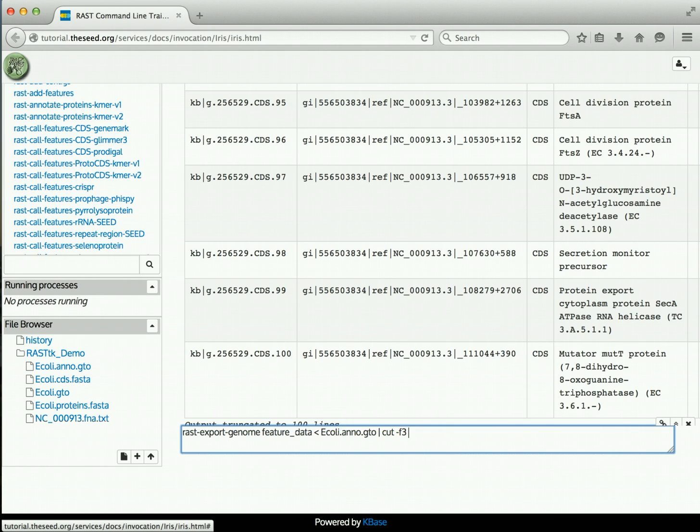And I'm going to pipe that output into another Unix command called sort. And the -u option on sort sorts unique. So now what I've asked for is every member of this third column sorted uniquely so that I can see the different types that are there. And then we'll hit return.